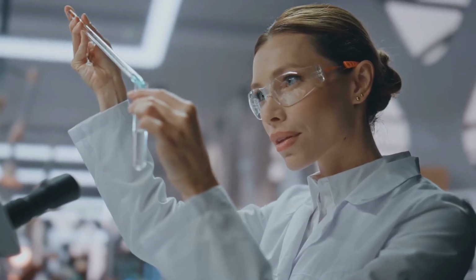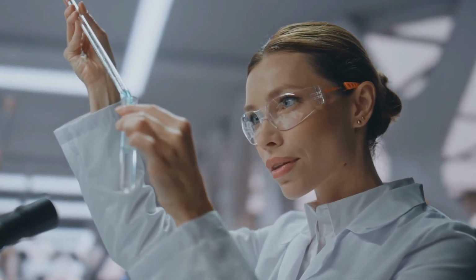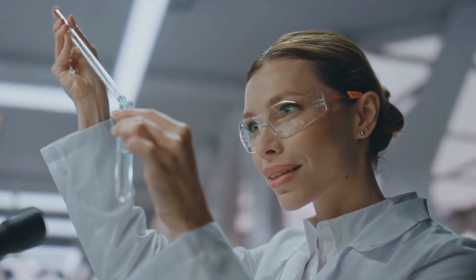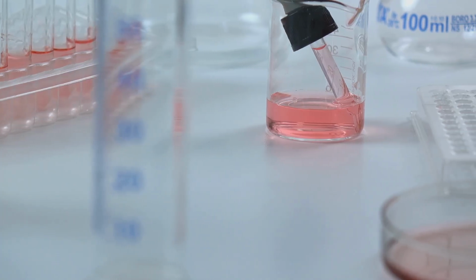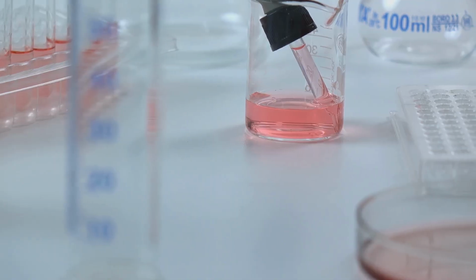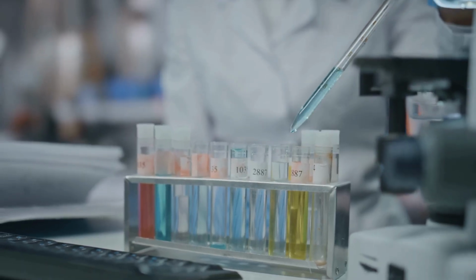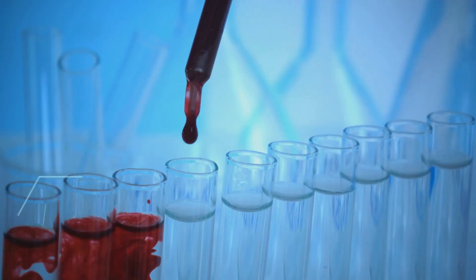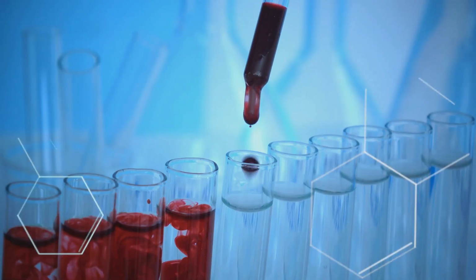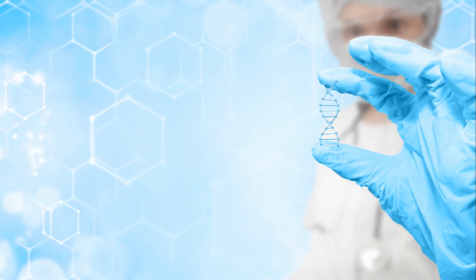At its core, NAAT allows researchers to multiply a specific DNA or RNA sequence millions of times, making it easier to analyze. Unlike simple detection methods, NAAT uses enzymes to replicate nucleic acids exponentially. Whether it's PCR, RT-PCR, or isothermal amplification, the principle remains the same. Turn a single molecule into enough material for clear analysis.